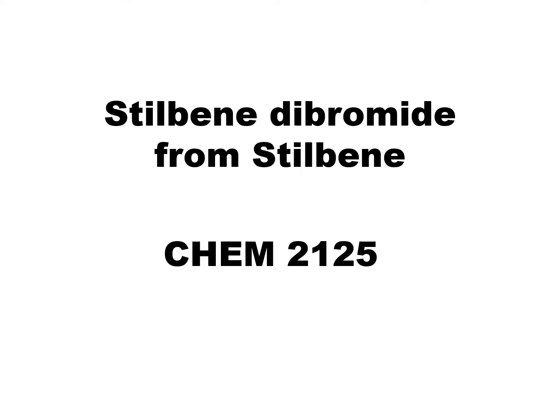Hello there. For this week's experiment, we will be looking at synthesis of stilbene dibromide from stilbene. This is supposed to be a continuation from our previous experiment on synthesis of stilbene from benzaldehyde, and the idea is to use that product to synthesize the stilbene dibromide.